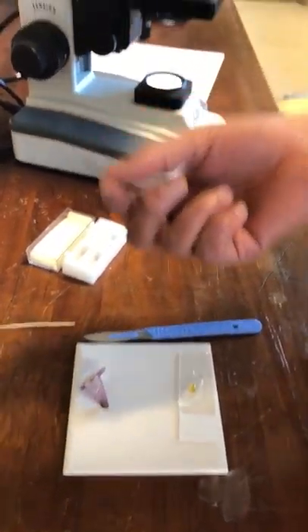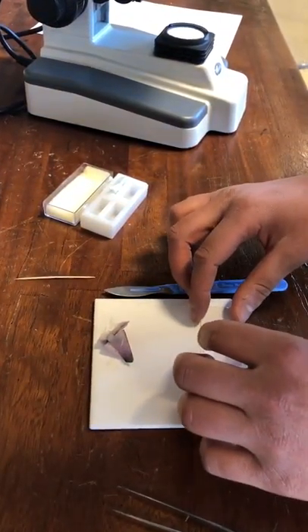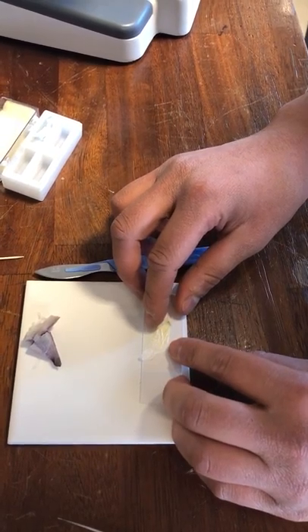Then get hold of your cover slip on the edge. Be really careful not to pick up more than one, because they are very thin. Hold it on the edge so you don't smother it in fingerprints, just drop that on top, and then very, very lightly press down.